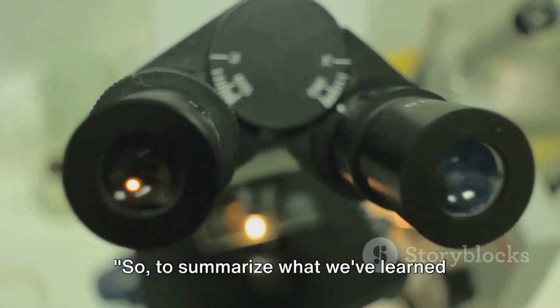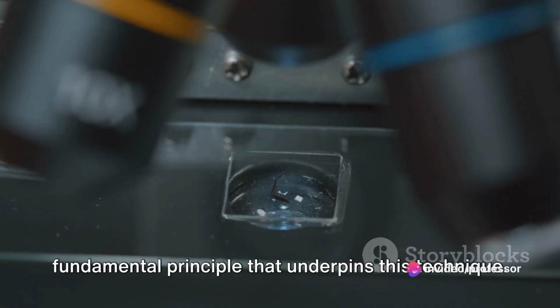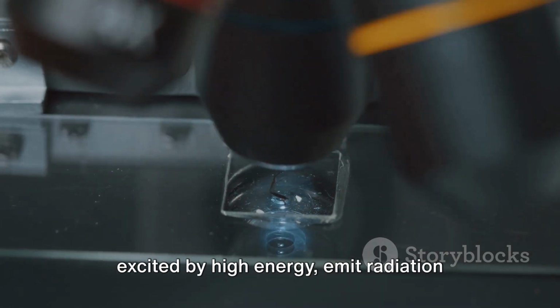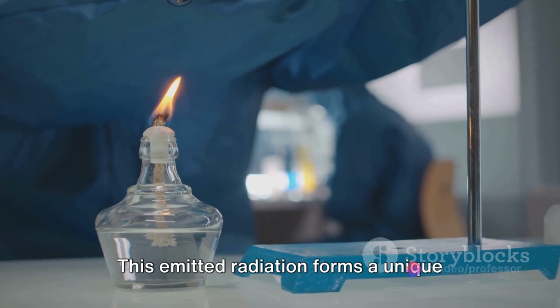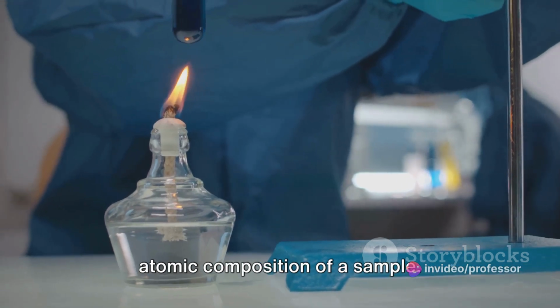So to summarize what we've learned today about atomic emission spectroscopy, we started off by exploring the fundamental principle that underpins this technique. Atomic emission spectroscopy, or AES, is based on the concept that atoms, when excited by high energy, emit radiation that corresponds to specific wavelengths. This emitted radiation forms a unique spectrum, a fingerprint if you will, that can be used to identify and quantify the atomic composition of a sample.